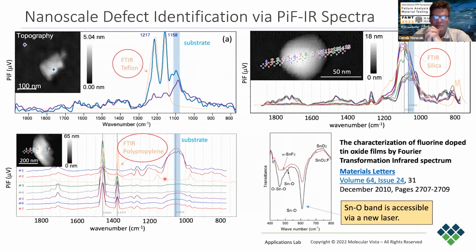just looking at defects. The way this would typically work, and during the discussions you can definitely correct me if I'm misguided in this comment, you take a topographic image, you see this shaped defect, and then you would say, okay, well, that shape infers it's maybe something like this. And then you have this catalog of all these images where, okay, I think it's this because the shape matches. But from our perspective, we don't need to know that.